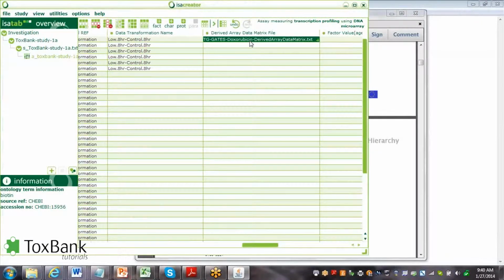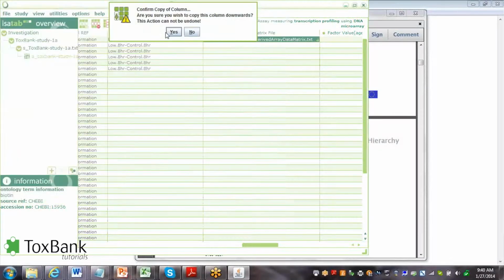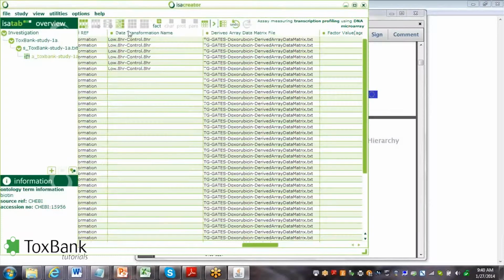And it's just a single file which relates these different fold changes, p-values, q-values to the genes based on this experiment design. And again, it's a single file across all the different tests, so we can use this useful function to copy the file link across all the different tests.